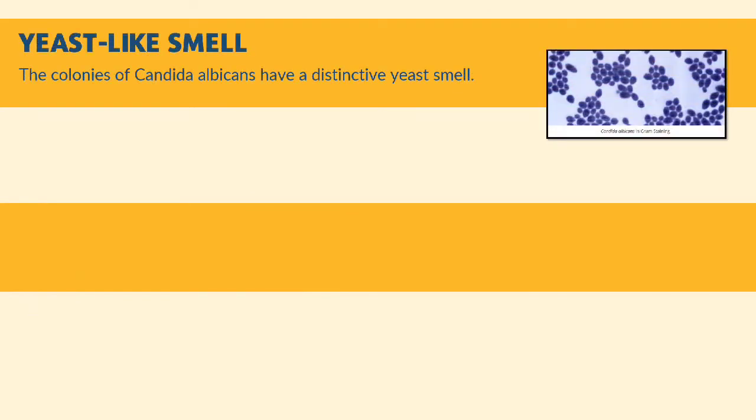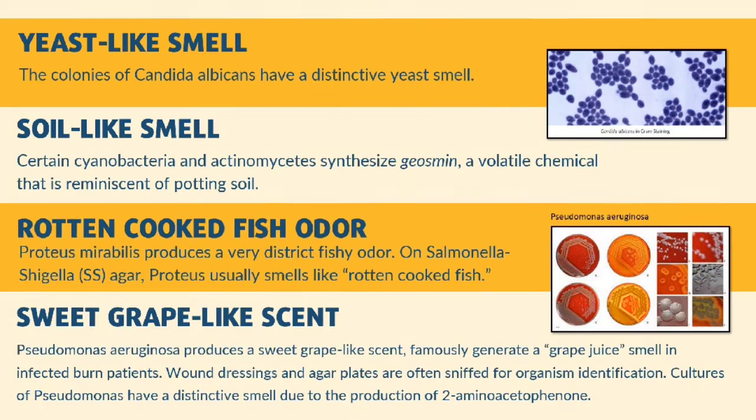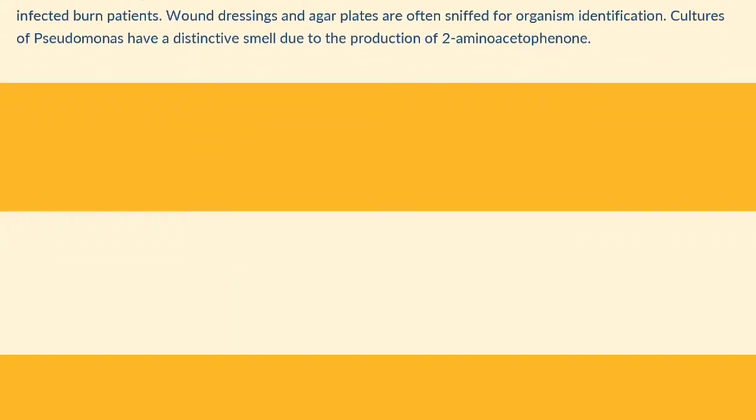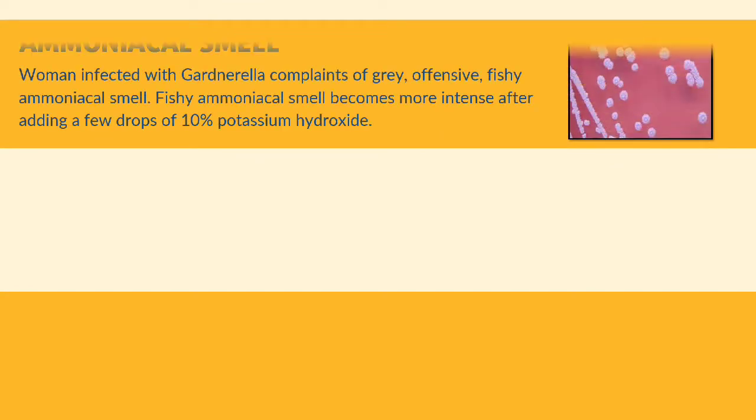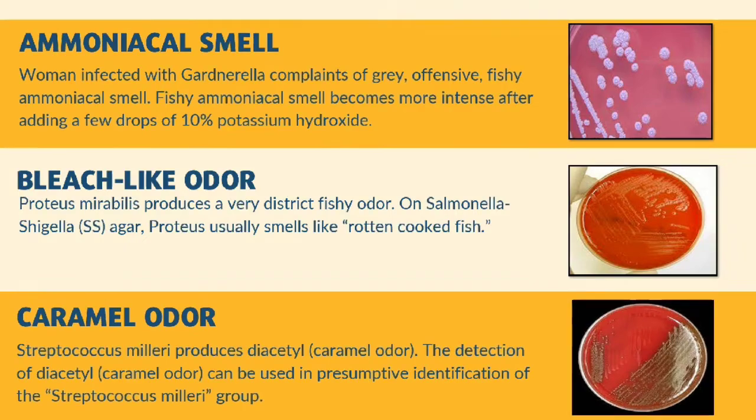It can be yeast-like smell, soil-like smell, rotten cooked fish odor, and sweet grape-like scent. It can also be ammoniacal smell, bleach-like odor, or caramel odor.